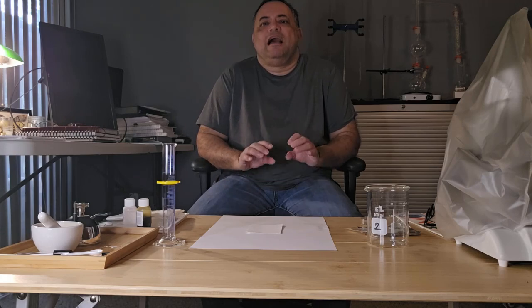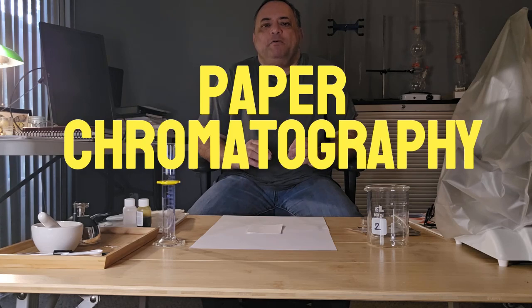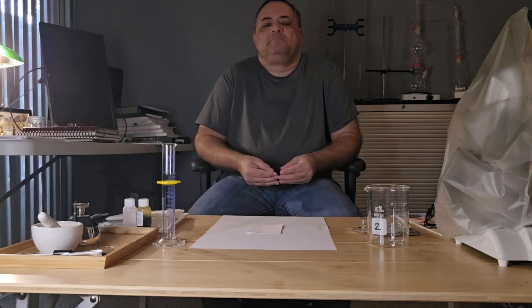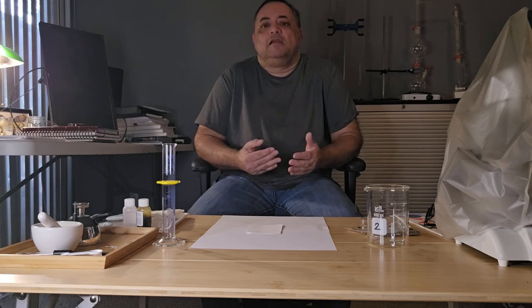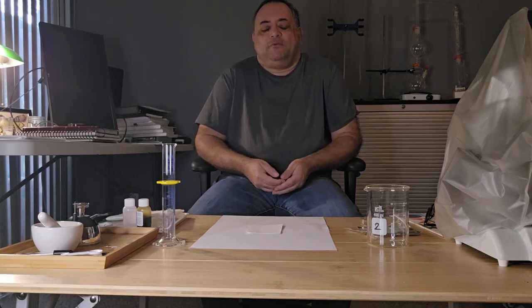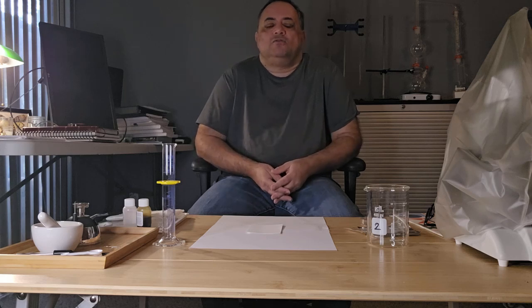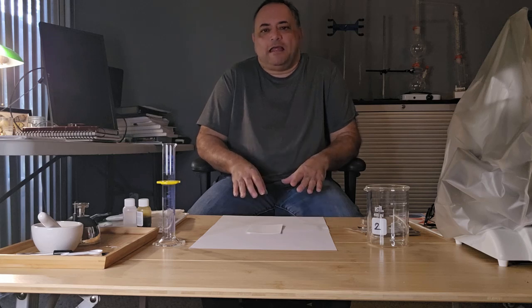For today's video, I'm going to demonstrate the most basic, simplest form of chromatography, and that's paper chromatography. Other forms of chromatography include thin layer chromatography, liquid column chromatography, gas chromatography, high performance liquid chromatography, and also ion exchange chromatography. Not all forms of chromatography can be done in a home lab.